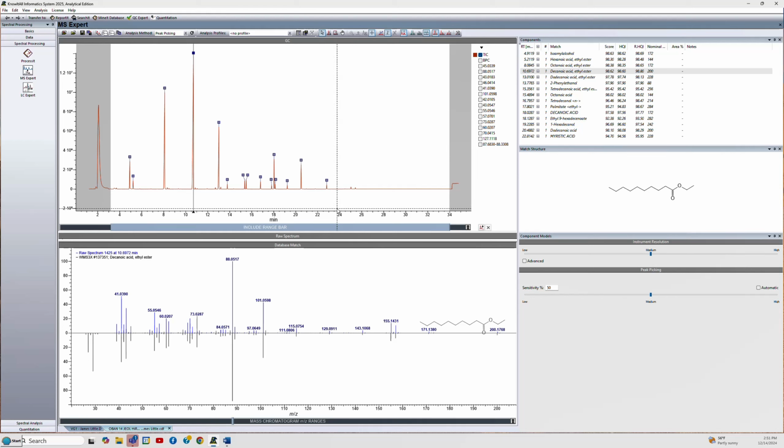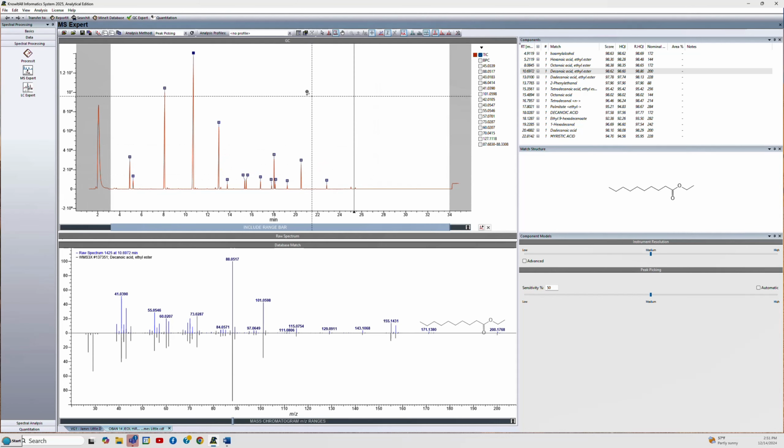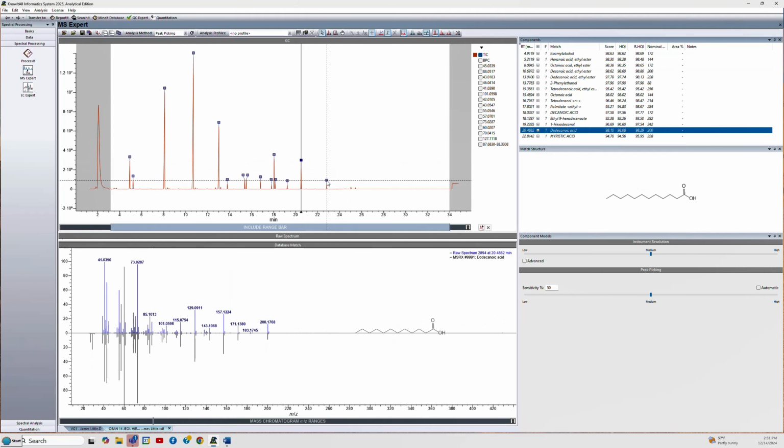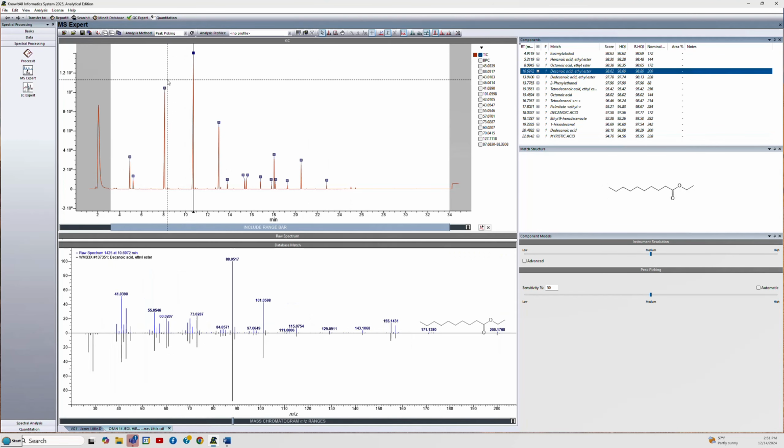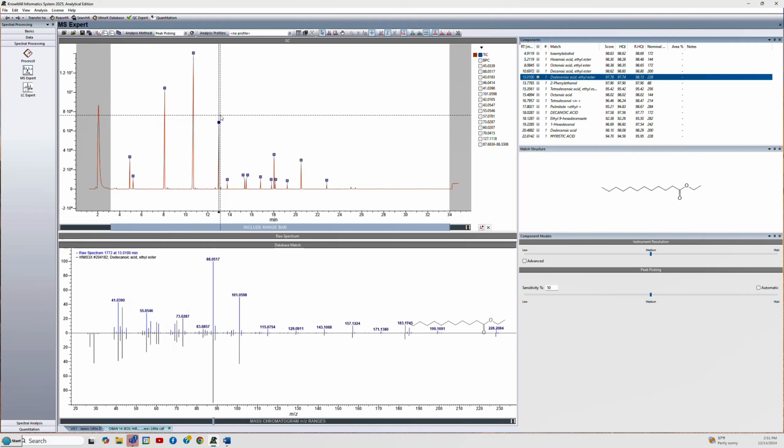So I think that's pretty much it. The only other thing you might want to expand things to look at little things, you need to right click and say box zoom mode, scan across it. Now you can look at smaller peaks if you wanted to. To get back out of that, you have to go zoom out. And then it's always best to go back into the selection mode. So when you're clicking on things, such as picking boxes to jump between the spectra manually instead of using your arrow keys, then it will be a select option.